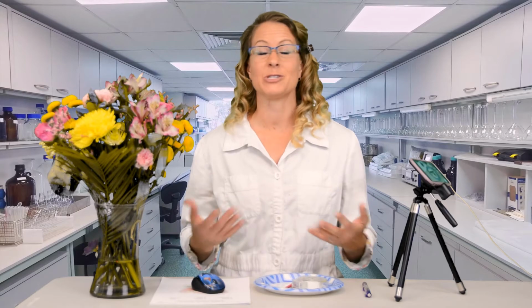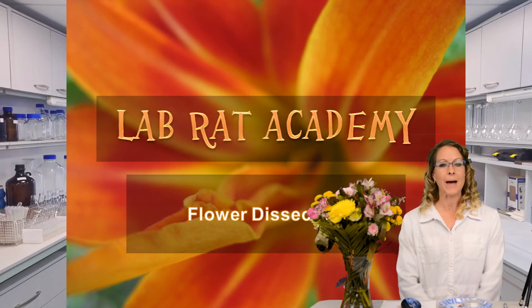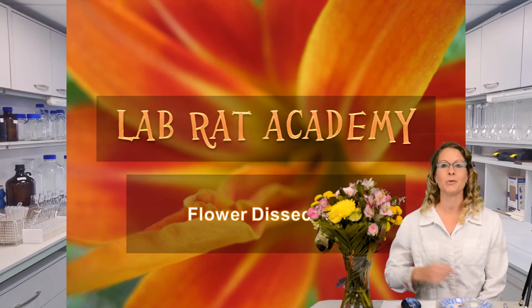Today we're going to be dissecting a flower. Actually, two kinds of flowers, and it's going to be so much fun. This is one of my favorite labs just because I love to learn about botany. Plants are really fun to learn about. So on the screen here, we have a PowerPoint lesson that we're going to follow along.